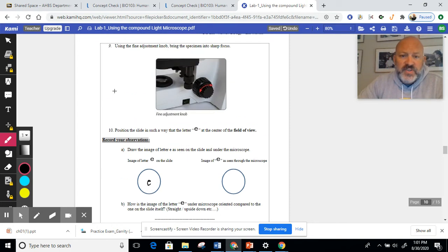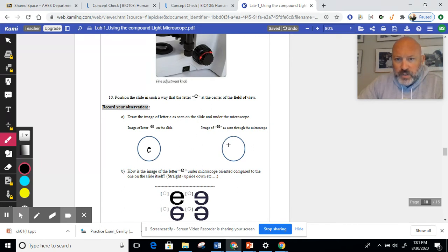And as you use the scanner lens and focus on it, what happens is a couple of things. Now, what happens is if I put this on the microscope like this, the first thing that happens is the image becomes reversed. So it'll get flipped around like this. But then it also gets inverted. So it gets flipped twice inside the microscope as it goes through the two lenses. So then it'll look like this.